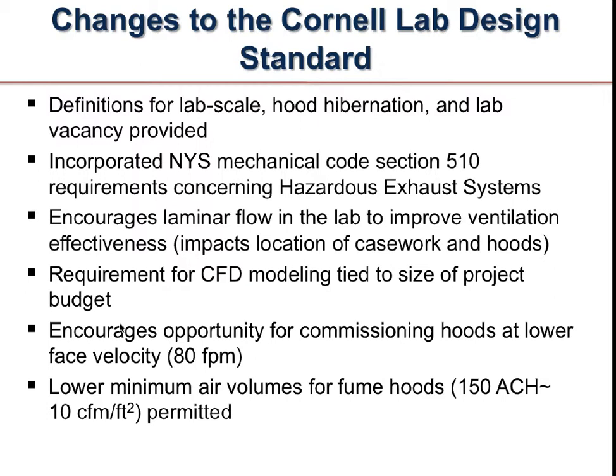The design standard encourages the laminar flow in the lab to improve the ventilation effectiveness. When you have casework and hoods and other equipment, freezers, growth chambers, etc., that are positioned in a way in the lab that blocks the airflow, those are going to end up being labs that are banded at 8 and 4 because they don't sweep the air through the room and out the exhaust points. So we wanted in writing that this is what we expect. We want casework to be located in such a way that there is this laminar flow.